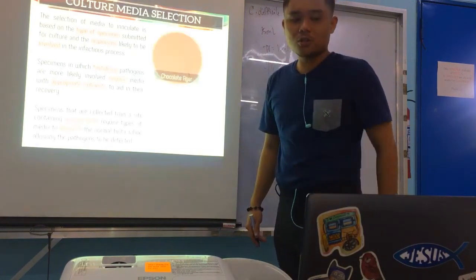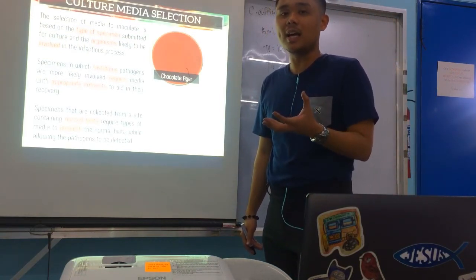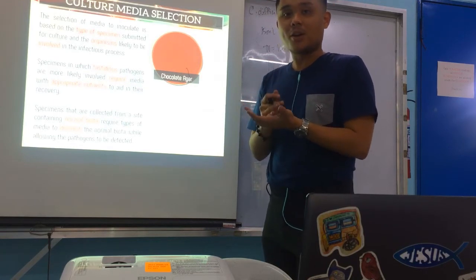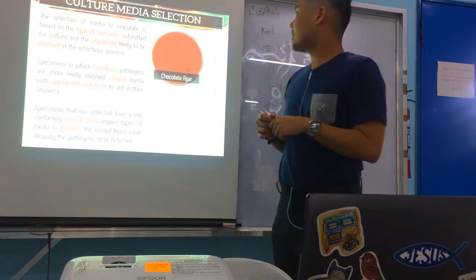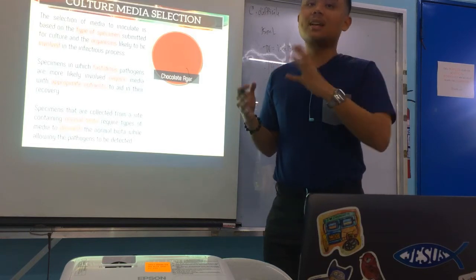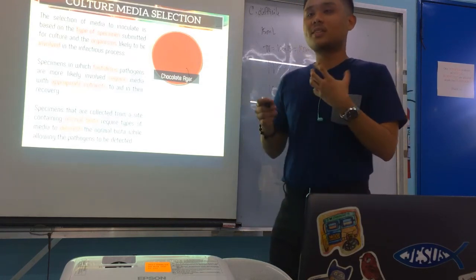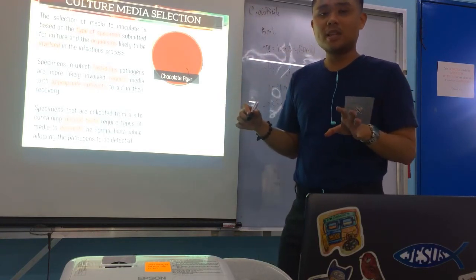And next point, if your specimens come from an area with normal flora or normal microbiota, then you should include culture media that would suppress the growth of this normal microbiota and let the pathogen grow. Example, let's say you receive a stool culture. Recall that stool has a lot of gram-negative Enterobacteriaceae. Now, maybe you're thinking that they are not the cause of the disease. What if it's Clostridium difficile? C. difficile can cause pseudomembranous enterocolitis.